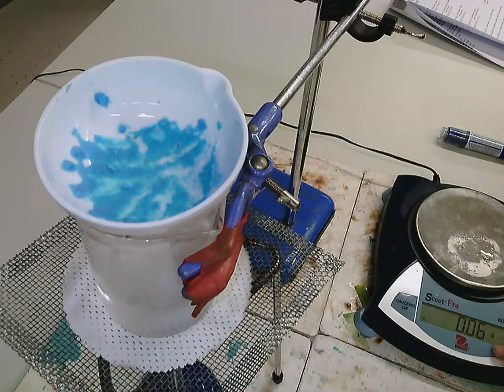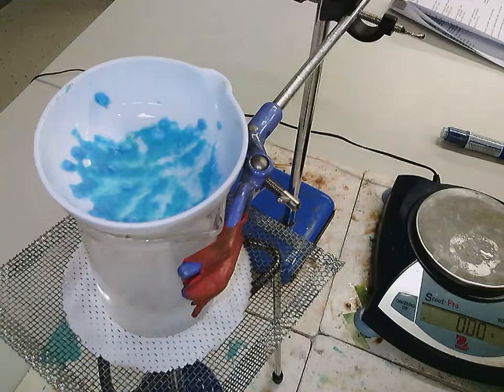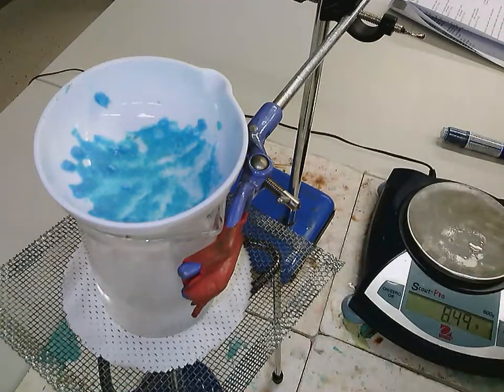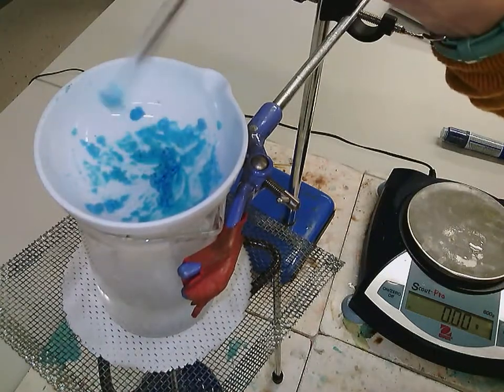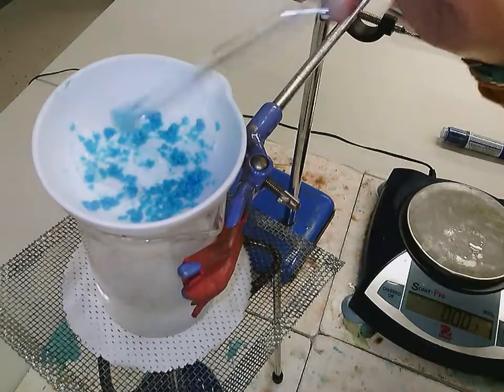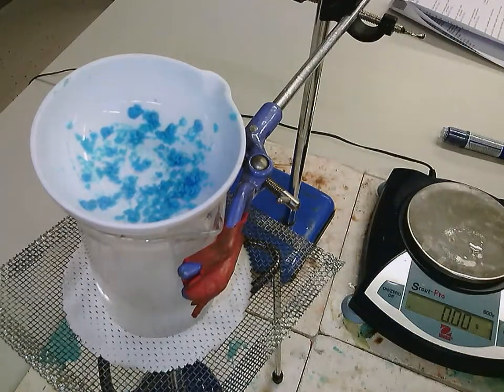Now this is going up because it's got water on there, so we'll just remove that by pressing tare each time to make sure it's a fair test. You can see that the water's going, because if you look carefully you can see these little lumps here, like that one and that one. They are whiter than the main bit, and that is because the water of crystallization is going. I can actually scratch them using a glass rod. Scratch. You can see there's still some water in there. I'm waiting for it to all evaporate. So I'll pause it and we'll wait again.